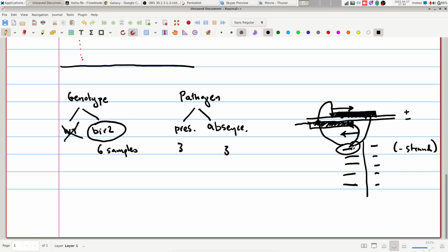This means that the reads will be mapped to the opposite strand of the gene that they are coming from. So this read comes from this negative strand, as I wrote here, but they will be mapped here. So I will assign it to the gene in the other strand. The same for this, the same for this, the same for this, and the same for this. So these 5 reads that would be mapped nowhere if I would put unstranded, because there is this overlap here, now they will be mapped to this gene.